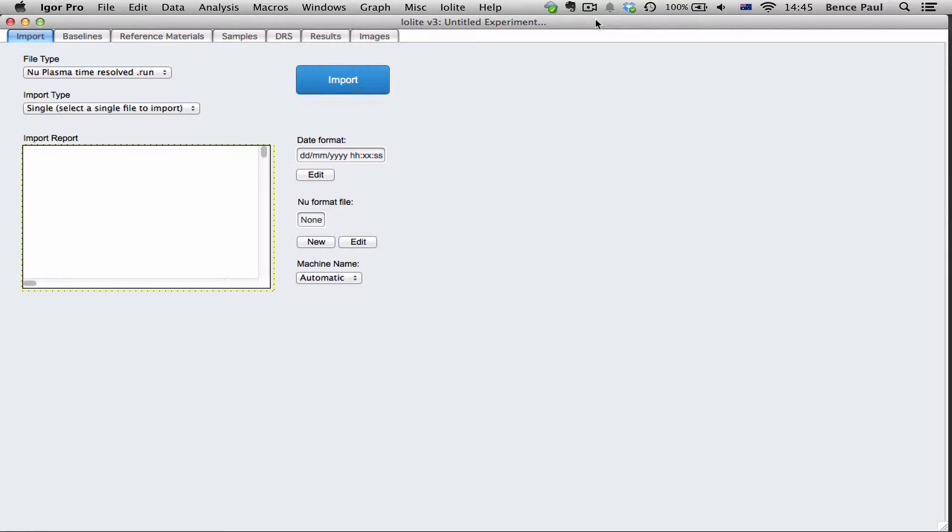In this video I'd like to show you how to load new Plasma .run files in Iolite version 3. It's slightly different to version 2.5 in that we no longer require the .nrf files. Instead we ask for a new format file.